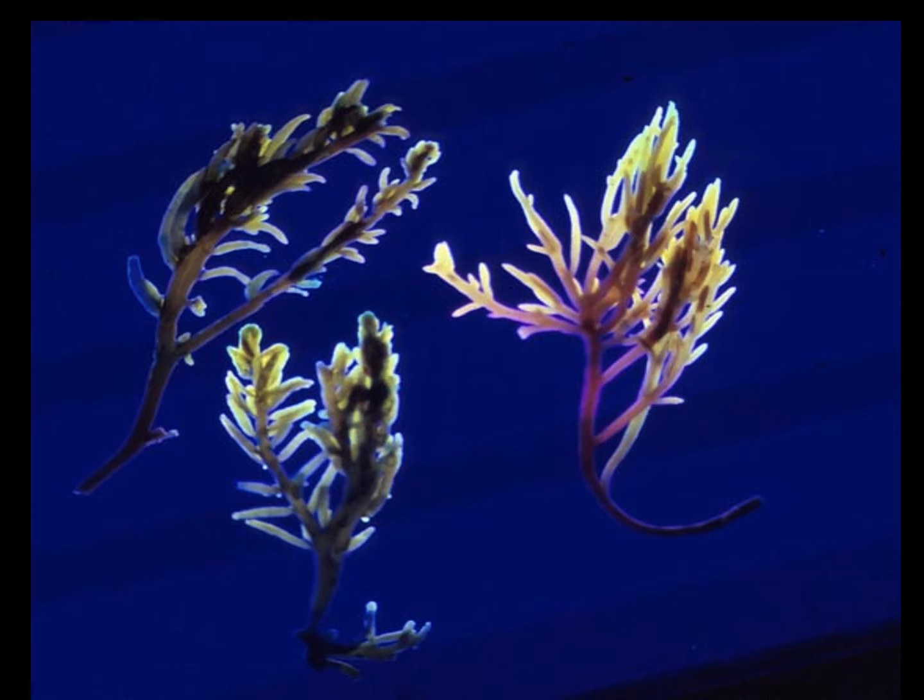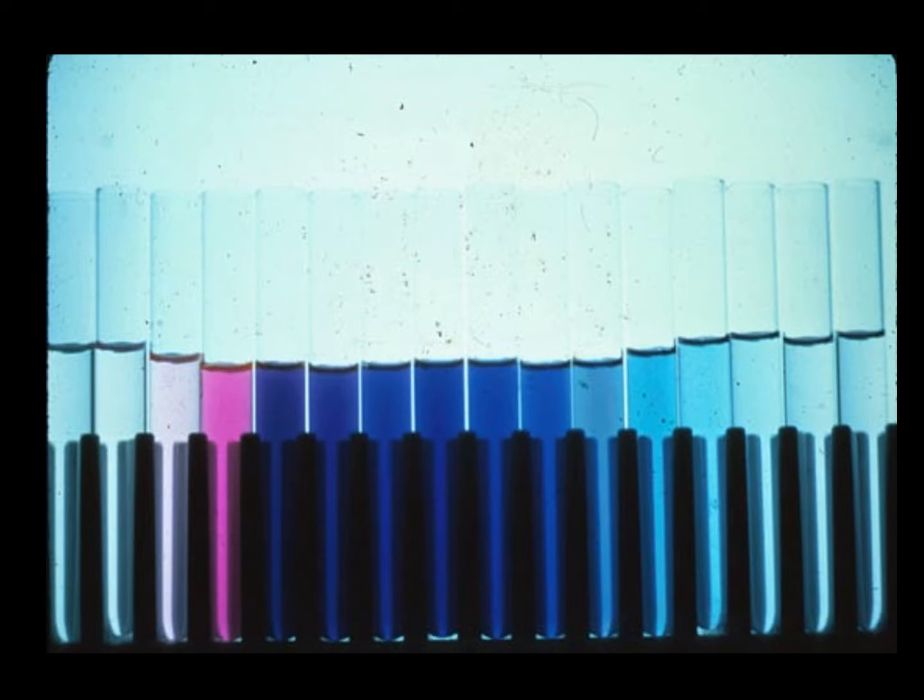Here it is. With UV, you see beautiful fluorescence of these antenna proteins, phycobili proteins, which collect the light with many fluorophores and transfer it by energy transfer to chlorophyll, from which the plants, of course, get their energy, their sugar, and everything else. And we extract these seaweeds, and we get these phycobili proteins, which can be sorted by, not by the FACS, but rather by chromatography. And there's some pictures of that.